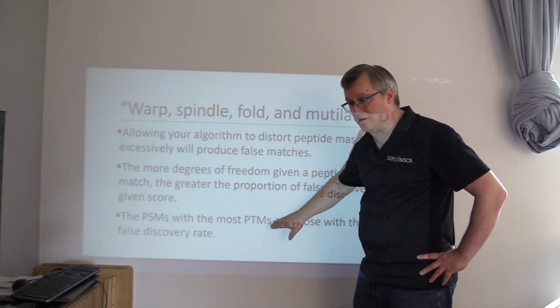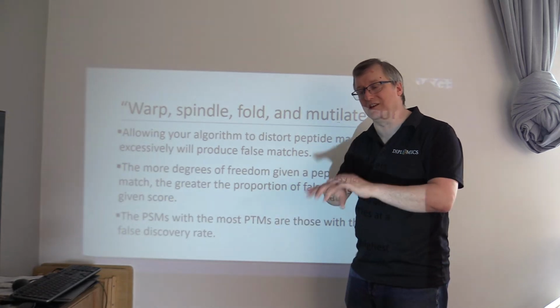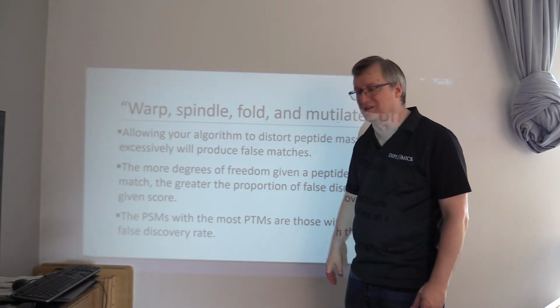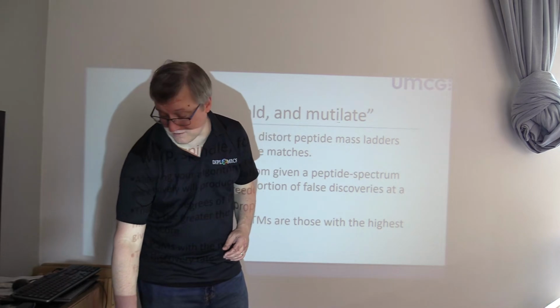Similarly, when you look at the PSMs that result from these searches, if a single PSM bears lots and lots of post-translational modifications, we should have a lot of doubts about them. They're quite frequently false positives.